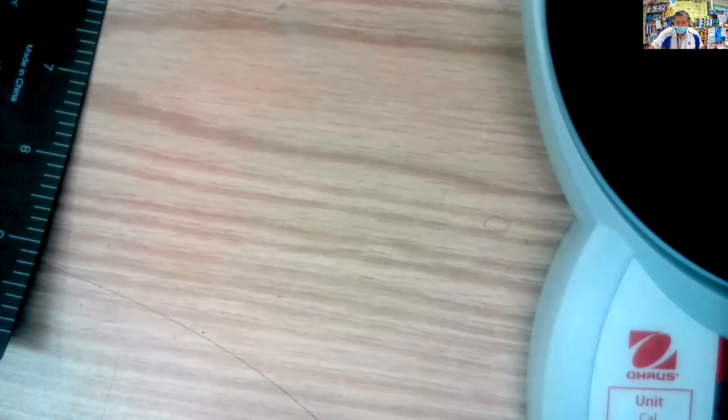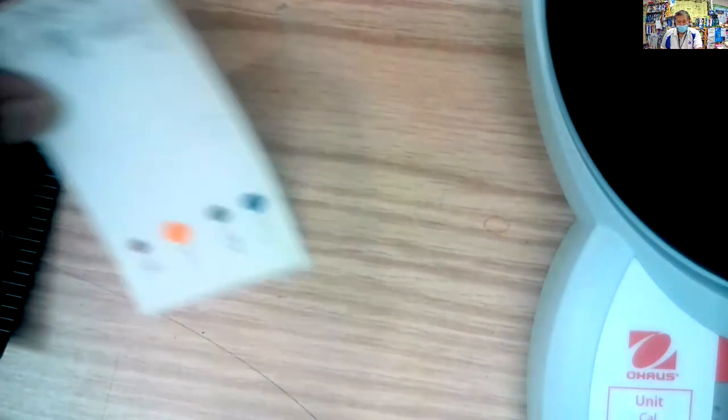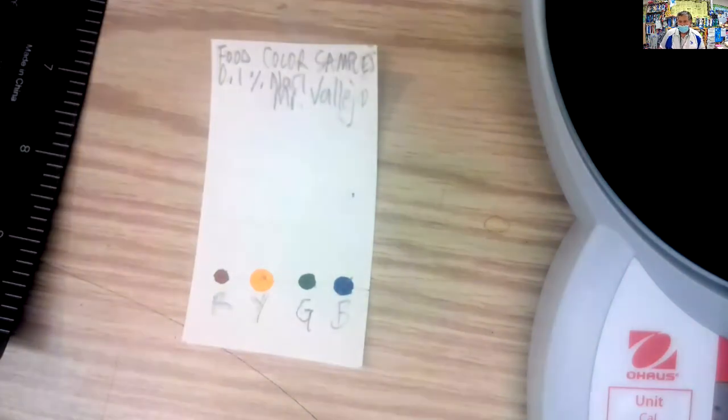I could also heat it up, as you know from previous chemistry experiences, but we're going to take that and we're going to try to separate these colors and separate the chemicals that make up those colors. So let me take a short pause, and we're going to wait for the salt to dissolve.